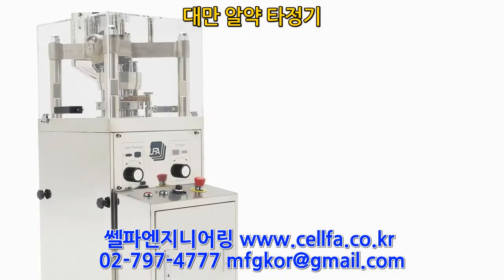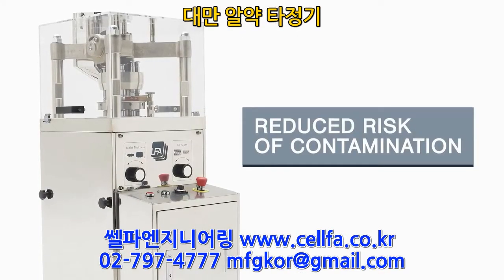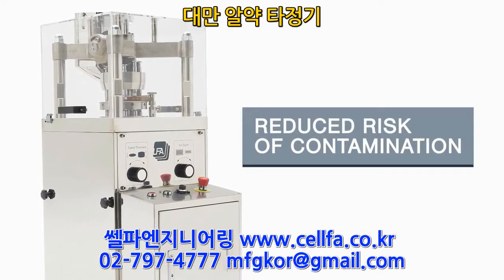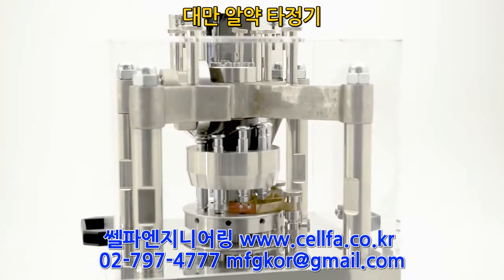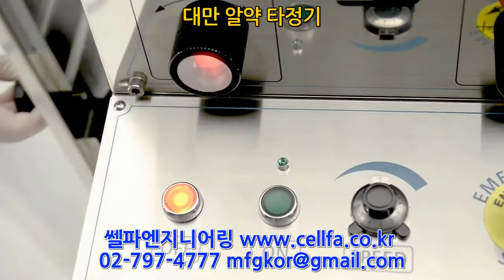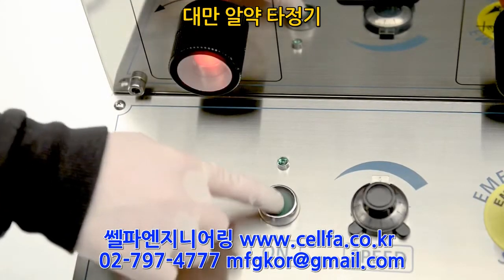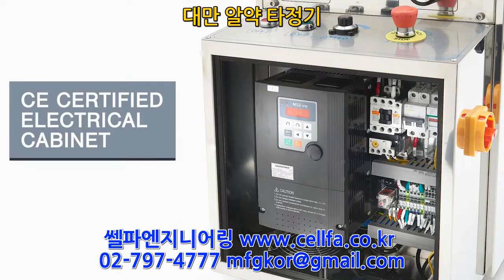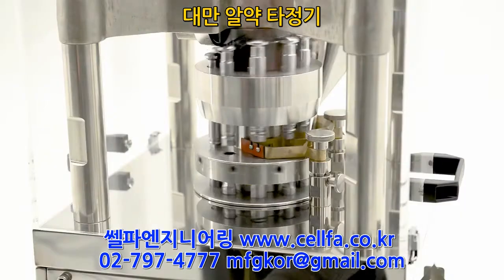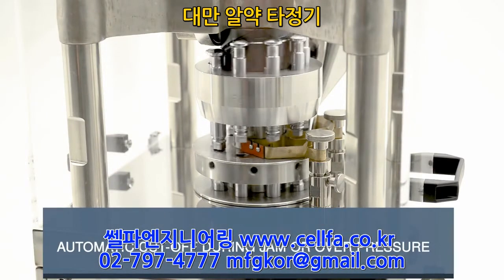The top section and the bottom section of the press are sealed from one another, reducing the risk of dust contamination. A Perspex shield with safety switches, as well as safety switches on all doors to ensure it won't run whilst they're open. A CE-certified dust-free electrical cabinet and emergency stop button keep your operators safe at all times, as well as an automatic cut-off protection during a jam or overpressure.